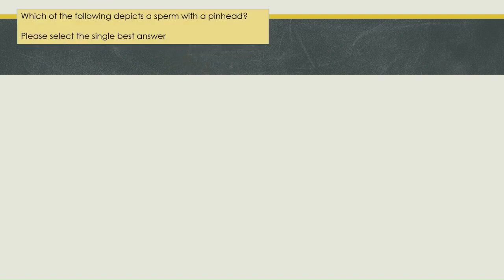Which of the following depicts a sperm with a pinhead? Please select the single best answer.